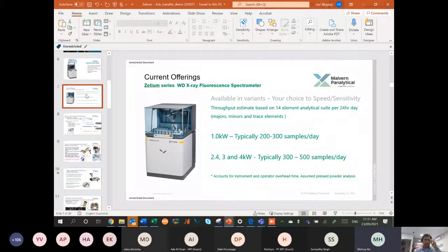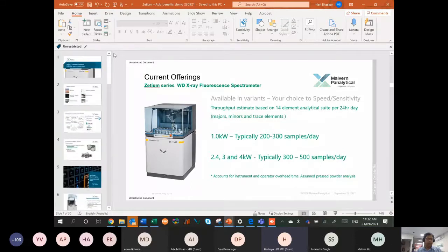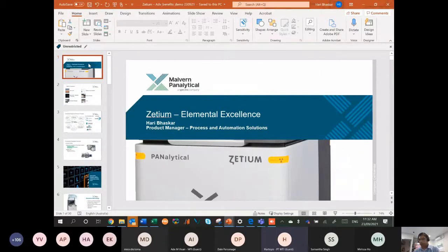Hartoyo, is there anything that you need to translate? Yes, this is one more question. Hari, one of our customers turns off the machines on the weekend. Let's say on Friday, then on Monday turn on again. But sometimes they get problems with stability, and the result is not acceptable.